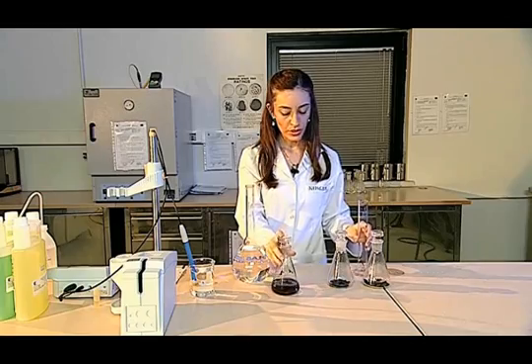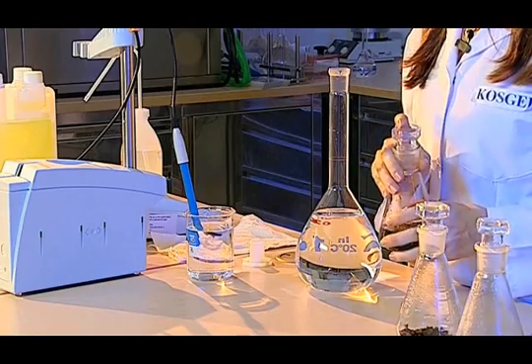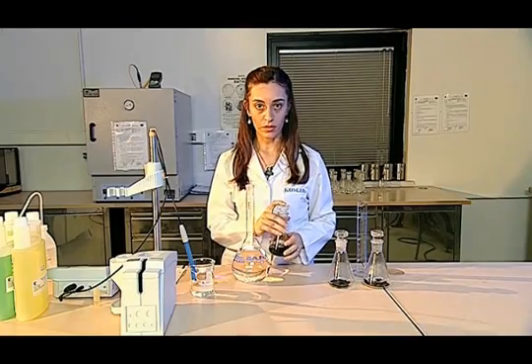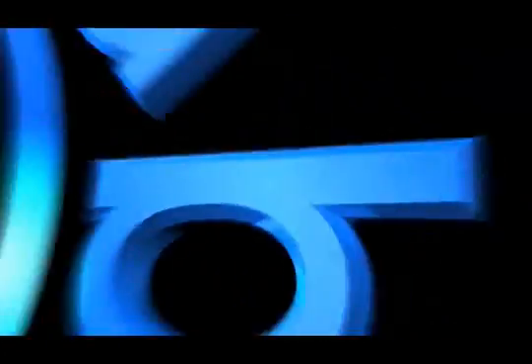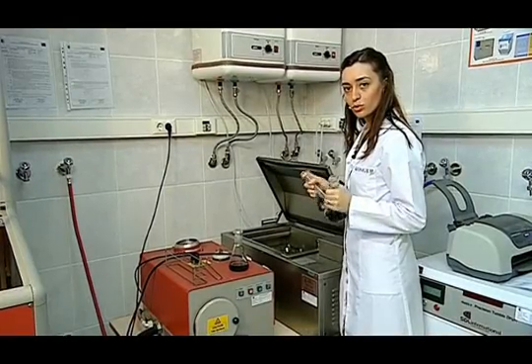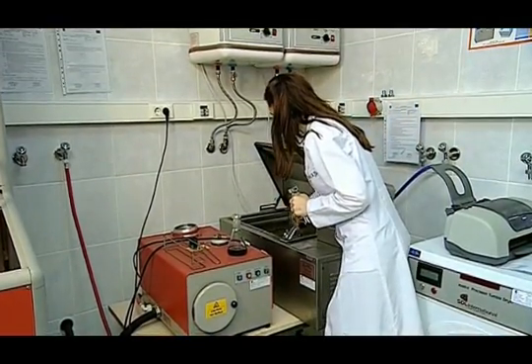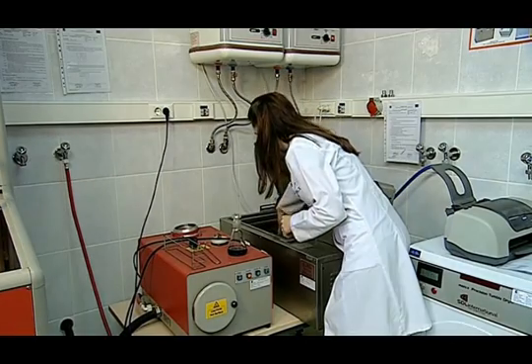The next thing to do is to place the prepared sample inside the mechanic beater, and leave it exposed to the churning process for 2 hours. Our prepared test samples that are put into the mechanical beater, which moves back and forth 60 times per minute, are shaken for 2 hours.